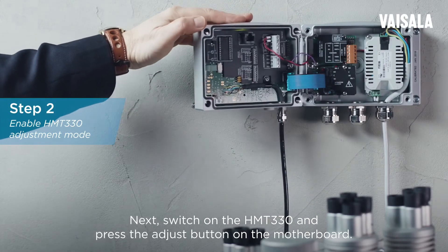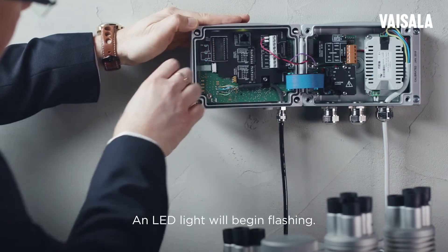Switch on the HMT-330 and press the adjust button on the motherboard. An LED light will begin flashing.